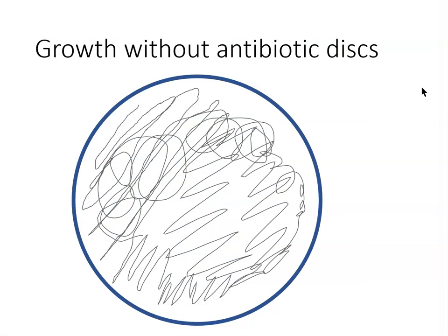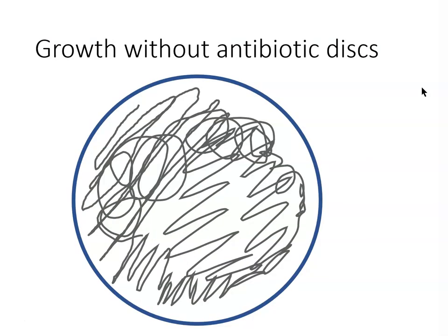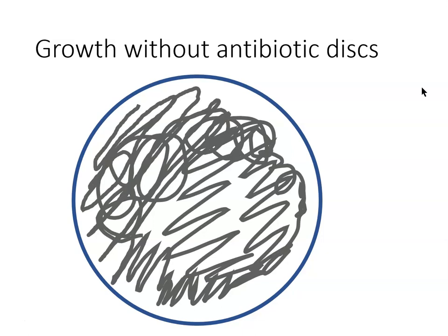If we incubated this plate, we would expect to see cells grow wherever I put them. I obviously didn't do a great job of putting the cells on there, but wherever they are, we see the line thicken as cells colonize and spread and grow. Where there was one cell overnight, there will be 1 million cells, something like that. So this is what we would see.